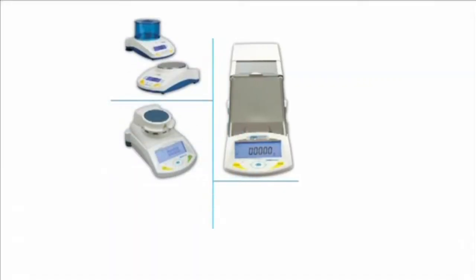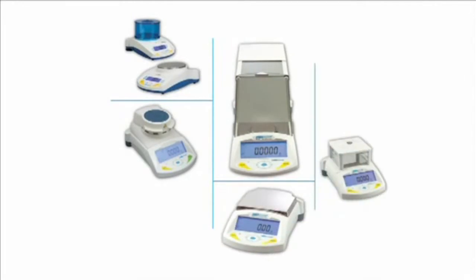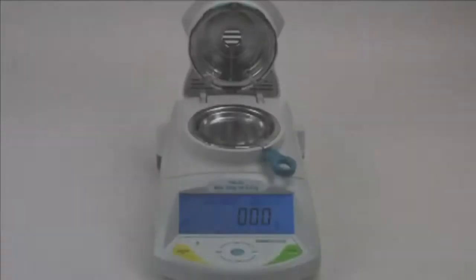Welcome to Adam Equipment's video training series. This video will provide an overview of Adam's moisture analyzers, the PMB series. Let's take a look at them now.